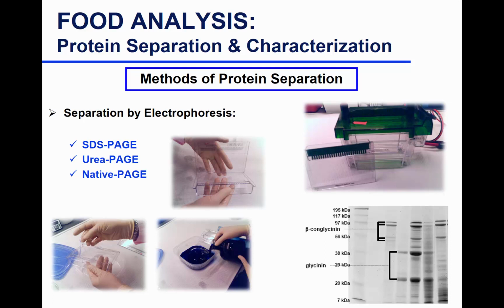Broke it. And then you gently open it. Now this is an old gel. It might crack, but usually we use a wash bottle of water to ease the gel out without breaking it. It's a really thin layer of gel made of acrylamide.